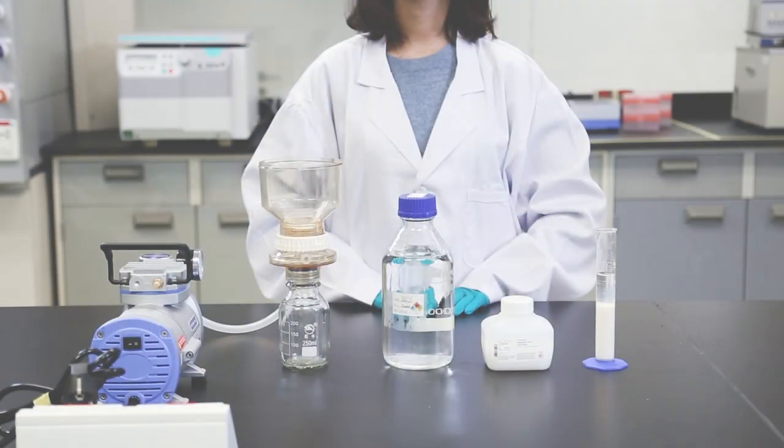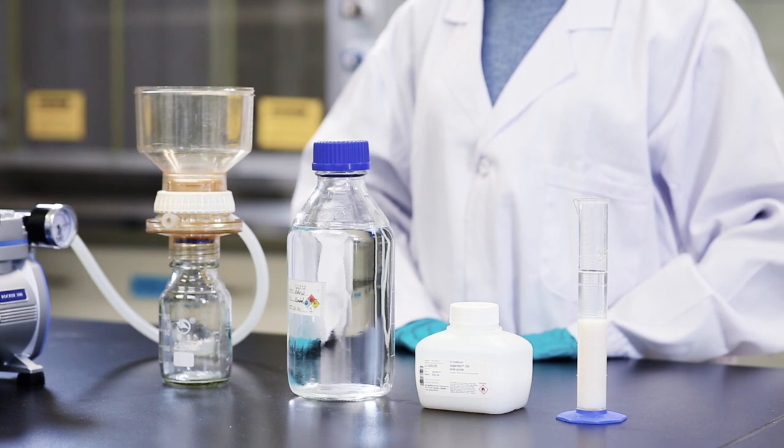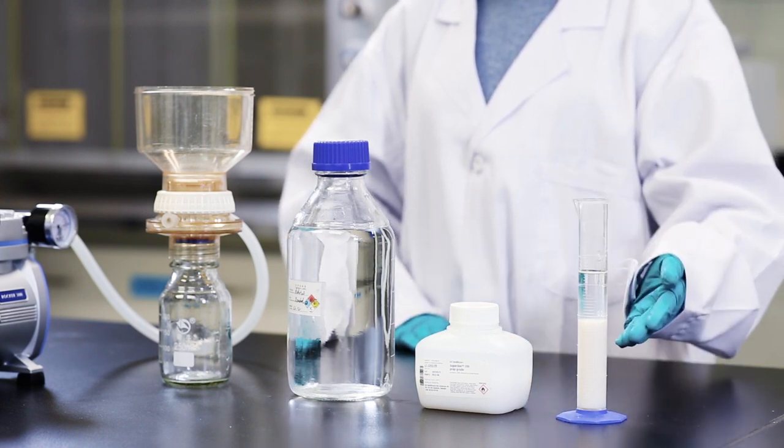Estimate the amount of slurry needed based on the final volume of the column. Most of our resins are delivered in a slurry concentration of 75% in storage solution, in most cases 20% ethanol.